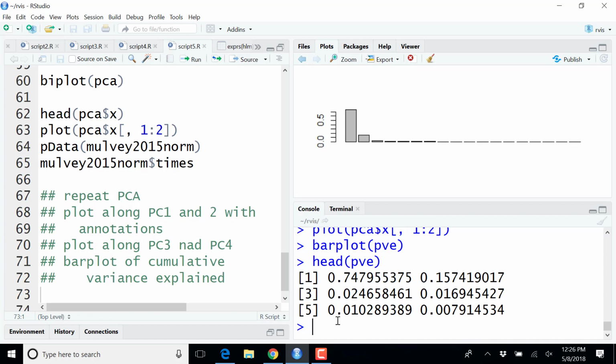And so principal component analysis is also an algorithm that is used to pre-process your data before running it through another algorithm. So if you have high-dimensional data with hundreds of dimensions, and lots of these dimensions are not very informative, what you can do is run principal component analysis, get 100 new principal components, and select the principal components that explain, let's say, 95% of your variability. Let's say these are 20 PCs, and then use this 20-dimensional data set as input to another algorithm.